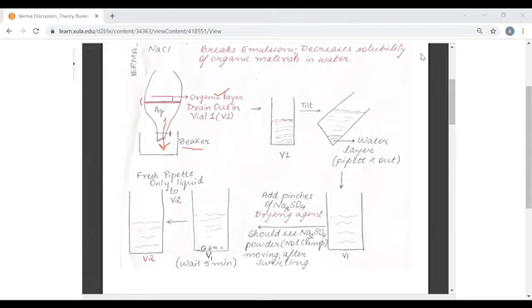You will take your organic layer in a special vial. You can label that as V1. Tilt it, and at the bottom, you will see the water droplets collected together. You can pipette it out by keeping it tilted.